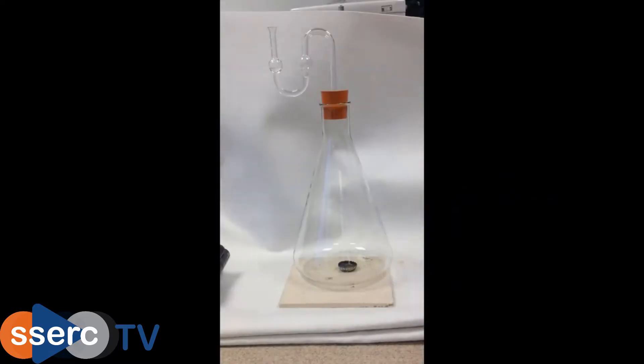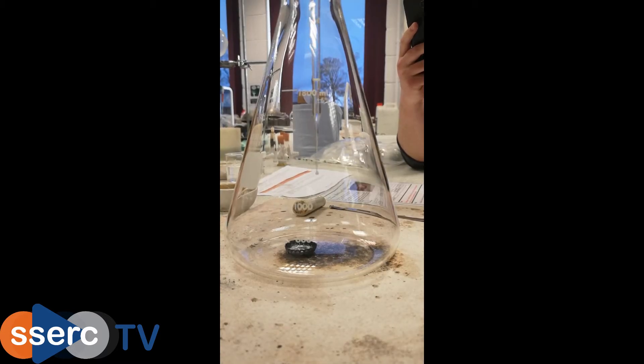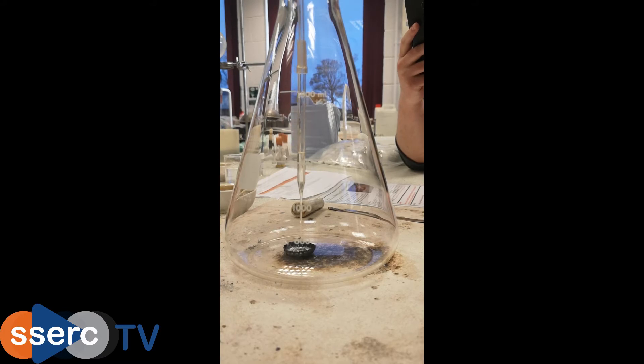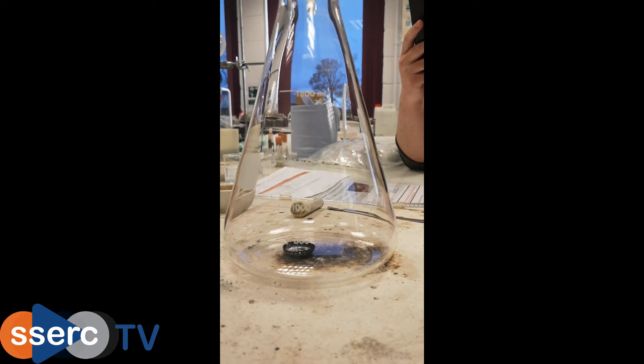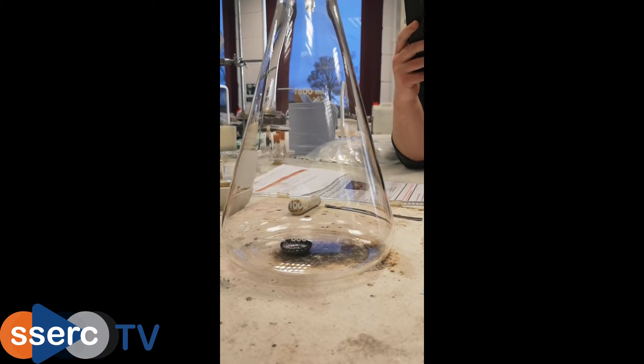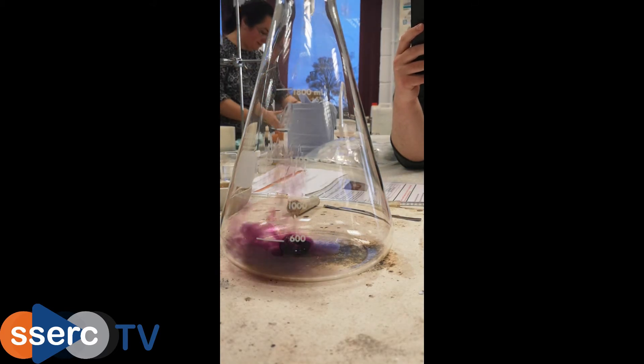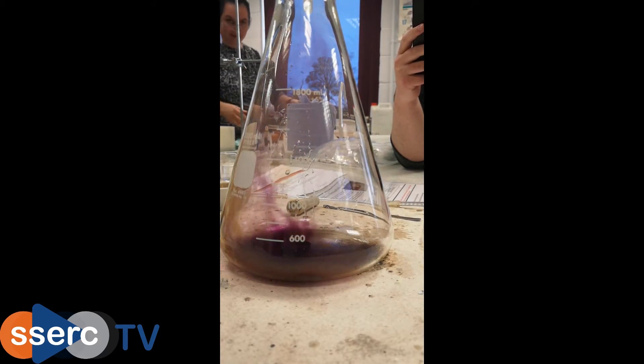If you don't have access to a fume cupboard you can use a large flask instead. The aluminium-iodine mixture in this case is put in a bottle top and this is placed in the bottom of a large flask. A drop or two of water is added and then a bung with a fermentation lock containing sodium thiosulfate is put in the top. This prevents the release of any iodine fumes into the room. Once again you see the purple fumes of iodine as the reaction proceeds.